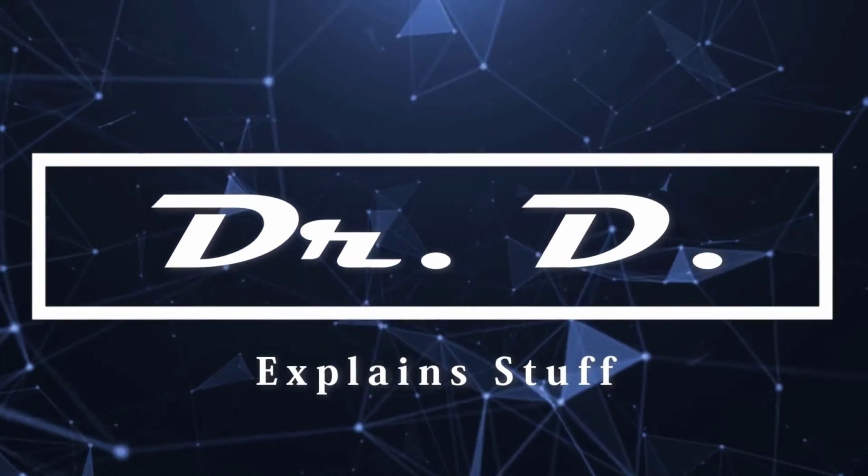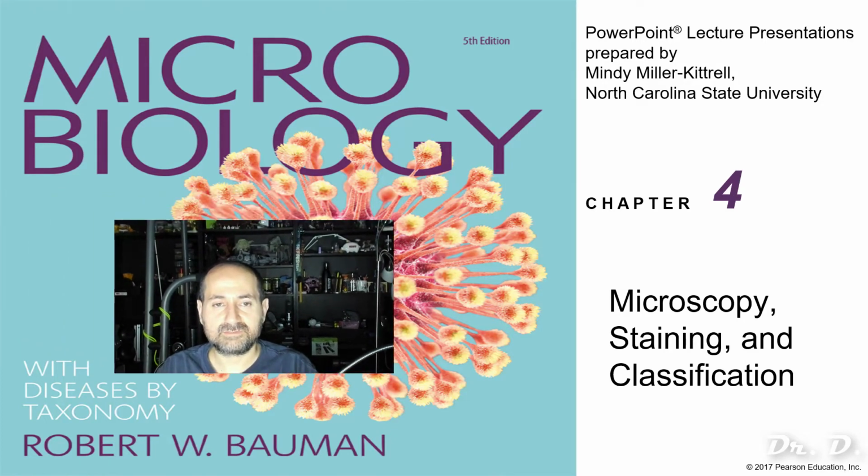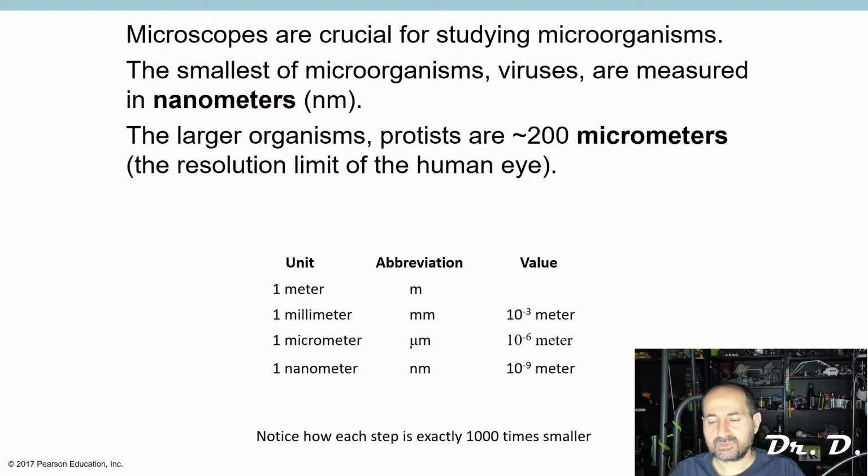Explain stuff. Hey everyone, Dr. D here. In this video we're covering Chapter 4, Microscopy, Staining, and Classification. So let's get started. The microscope allows us to see specimens that are smaller than what you can see with the naked eye.